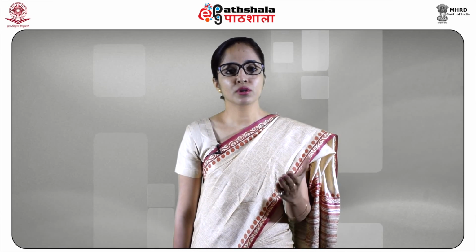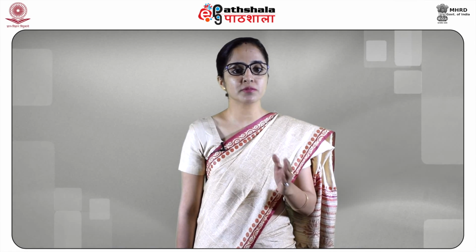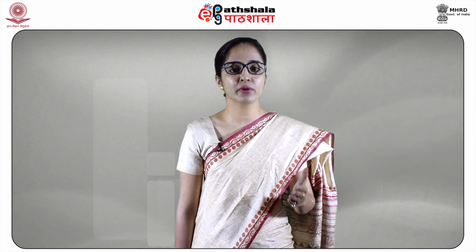Here we have finished UV visible spectroscopy, but I think it is much more beyond. The uses can be extended much further than simple experiments like those I have stated here. And as science progresses, the uses and applications of UV visible spectroscopy will definitely progress and make science more helpful in the detection of unknown organic compounds.